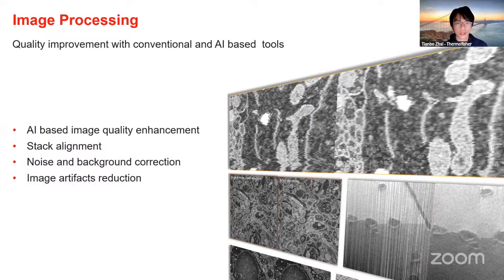For example, if you're trying to segment a particular biological structure, you definitely want to at least visually recognize it, so that with the segmentation result you have something to compare to. You can confirm this is the structure that you're really looking at.